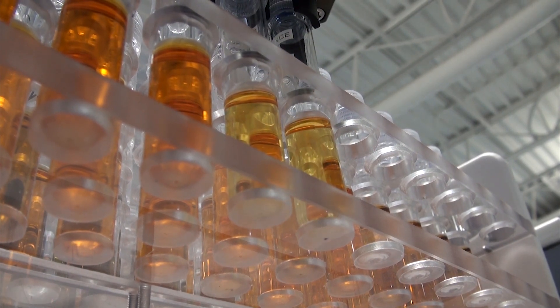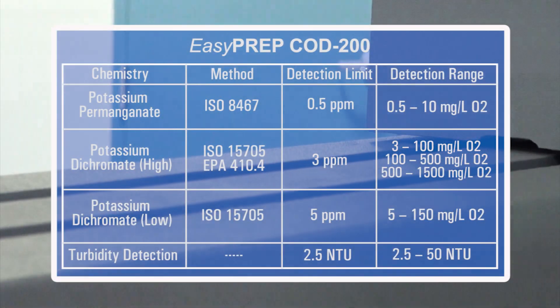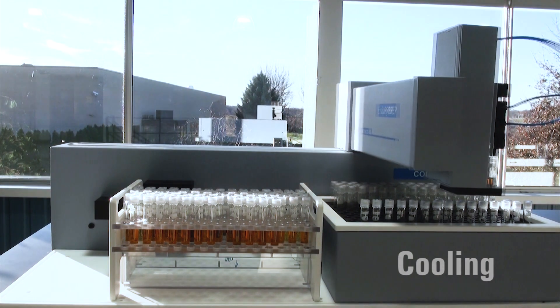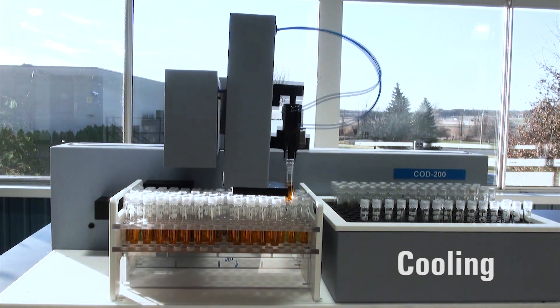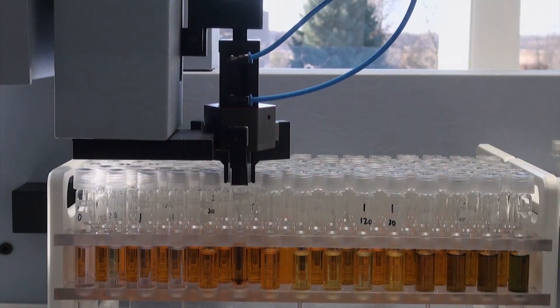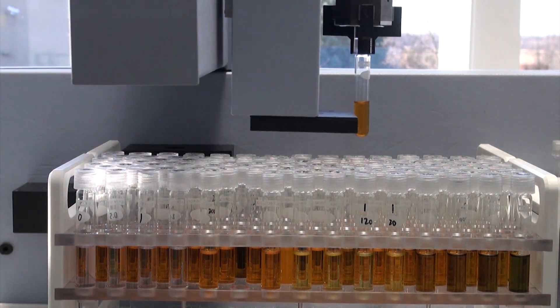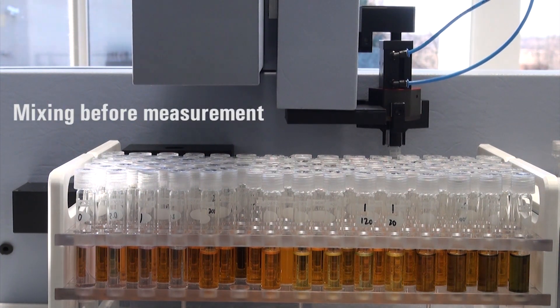COD 200 allows chemists to perform other value-added tasks while the system is in operation. After digestion, the COD tube is moved to the rack for cooling. Once cooled, it is moved to be mixed again prior to measurement with the onboard LED spectrophotometer. The parameters of the mixing function are user-defined.